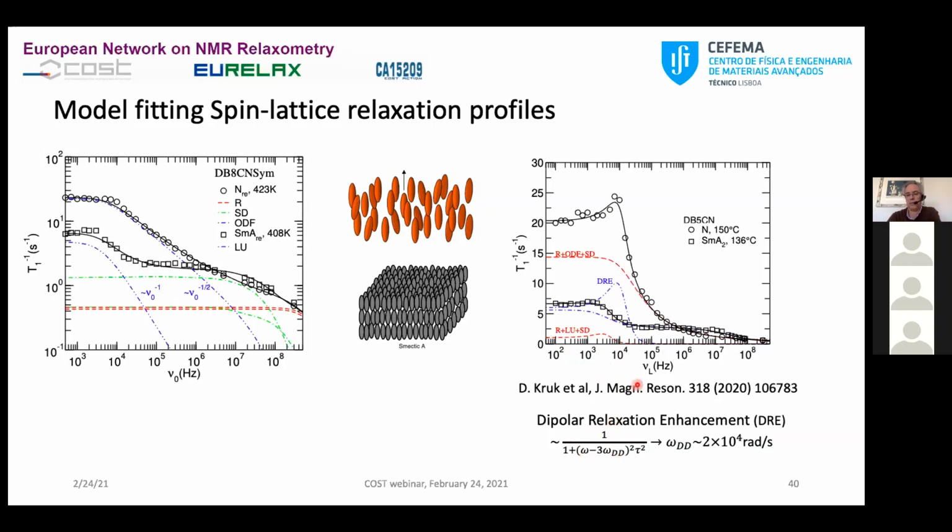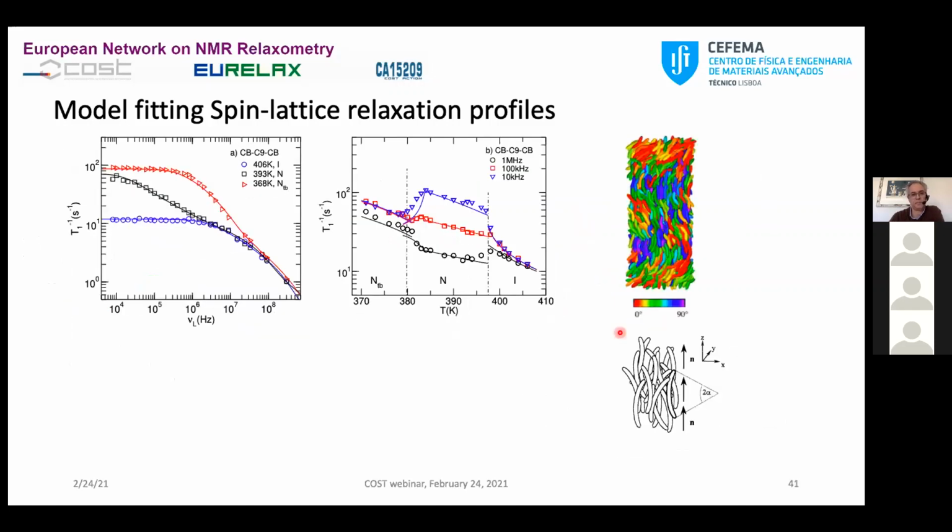So we are no longer sensitive to the Zeeman field because it goes below the dipolar frequency, which becomes dominant, and we come to a plateau which comes from the dipolar field. But still, this resonance aspect is a quite interesting feature that I learned, and that's what is interesting: to recover the data from 1988 and 1989 and to reanalyze it as we did.